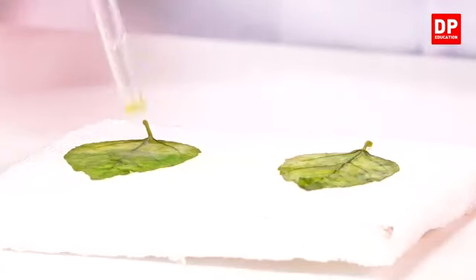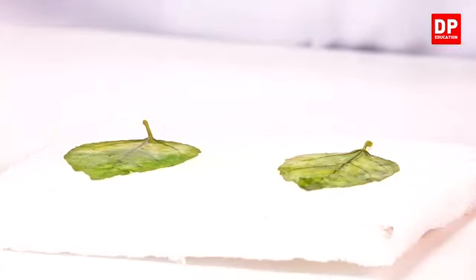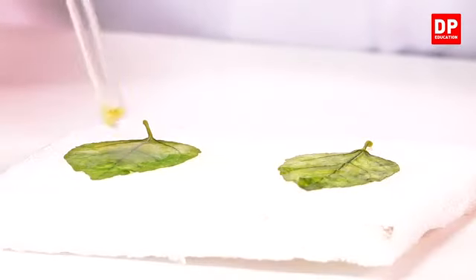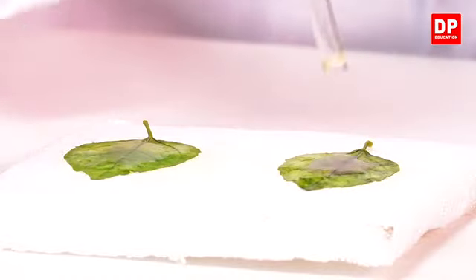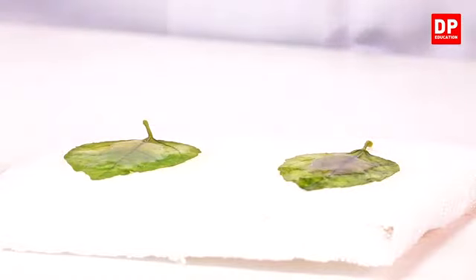So, I put iodine to this leaf. I put enough iodine, and the same way I'll put iodine to the other leaf. You can already see the color change taking place.